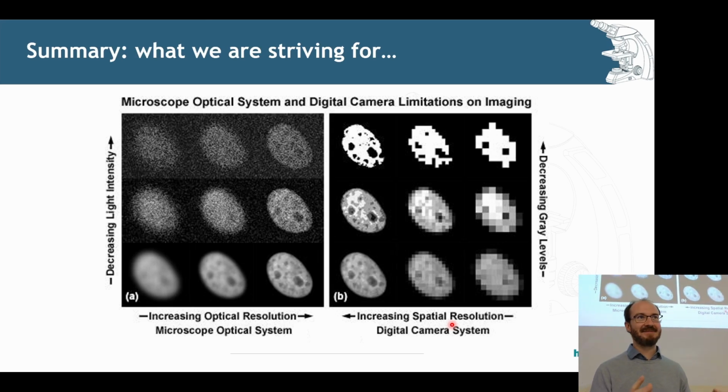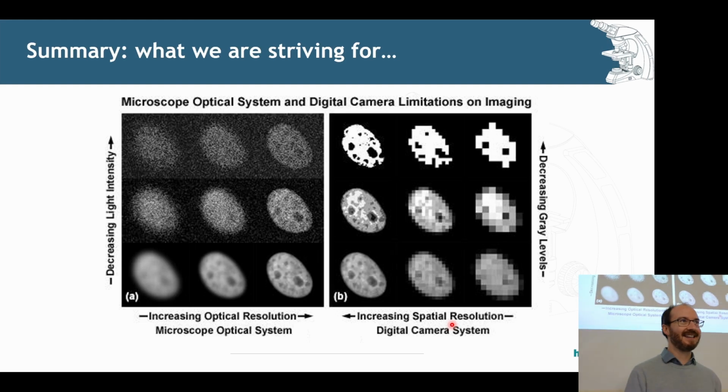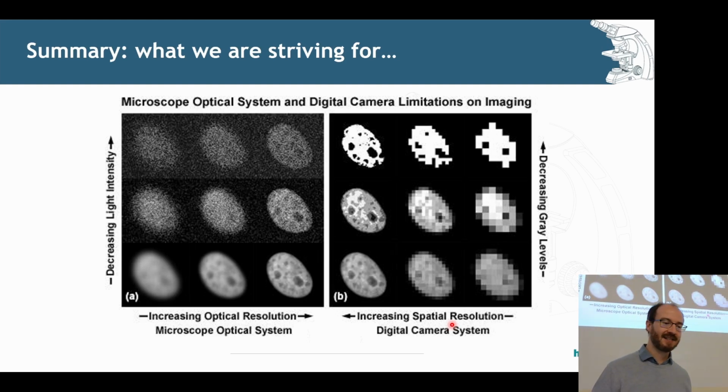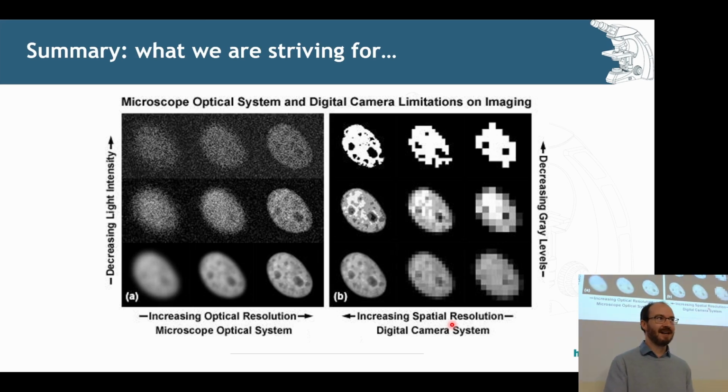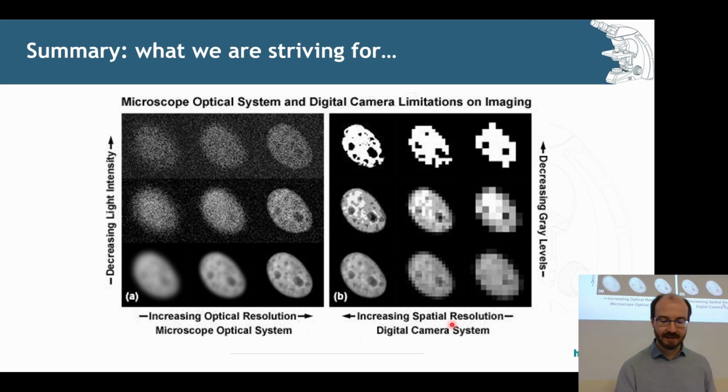I think it's a lot better now, Lisa. But initially, when I worked a little bit with the lab, there were certain situations where it's just like, hey, cool, generate all of these amazing data, and then it's like, but you set your gain so low that I've got basically 3 intensity levels to work with. There's no data there to analyze. So just realizing what is the thing that you're trying to do with the data at the end will determine how you end up acquiring them.